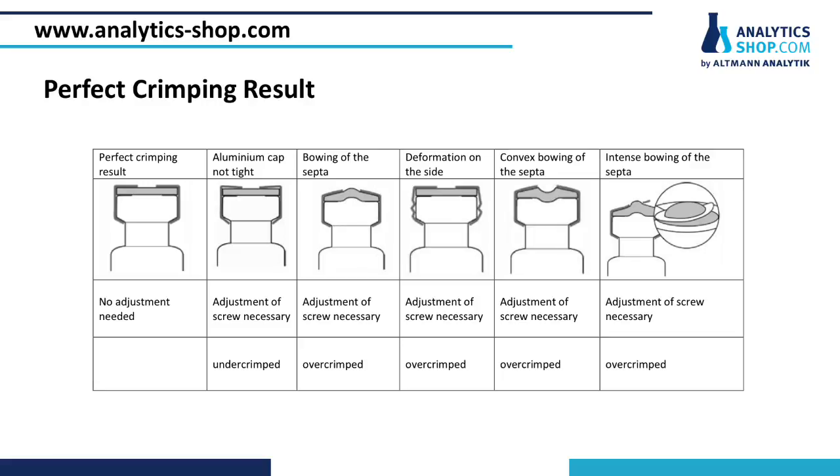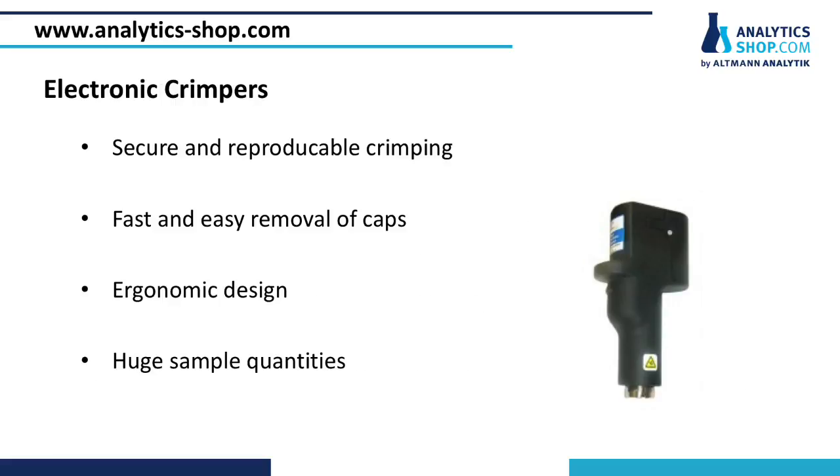Here you can see some examples of incorrectly crimped sample vials, which can be detected by an uneven septa surface or by non-tight and non-flat aluminum rims. A proper crimping result is especially important for headspace samples. If these vials are over-crimped, they tend to burst at the predetermined breaking point of the aluminum cap, even at low internal pressures.